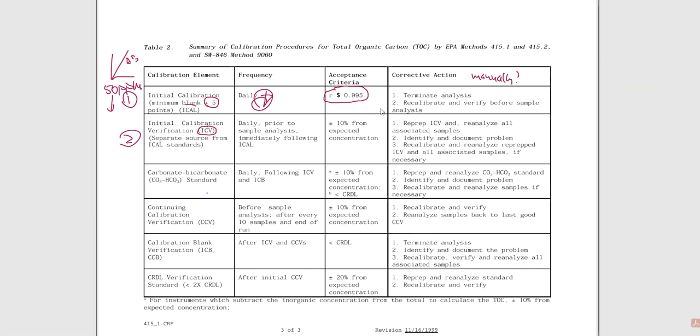Okay, that's great. What if that 50 ppm, though, was bad? What if it was contaminated? What if it was old? What if it was expired? What if it wasn't stored the proper way? What if it wasn't actually 50 ppm anyway? How would I know? I don't. Because if those things are bad, as I dilute them, then guess what? The bad parts of that standard that I am using, they're still there.